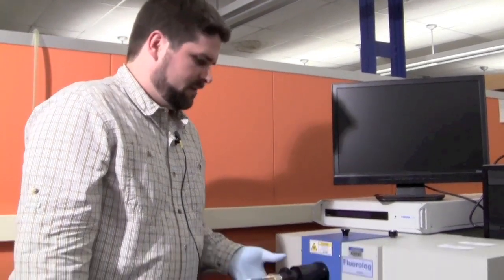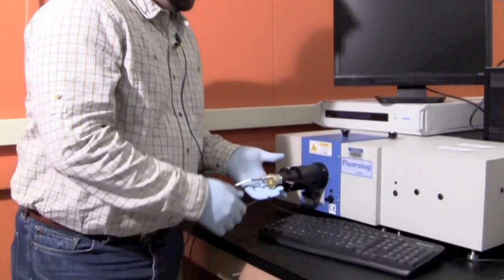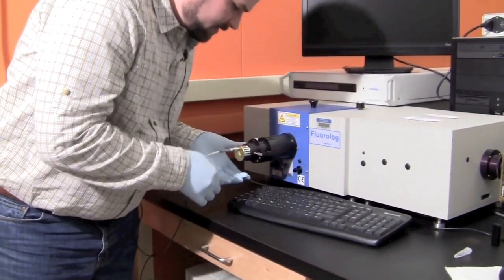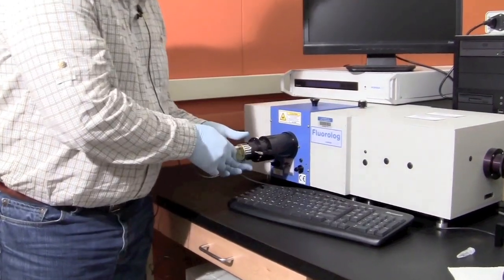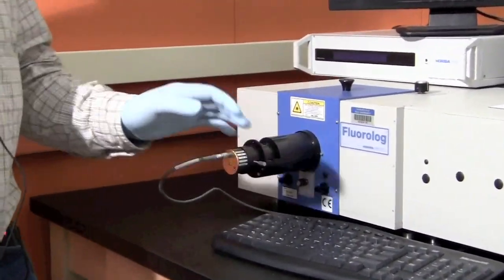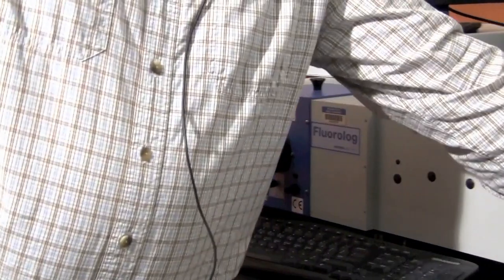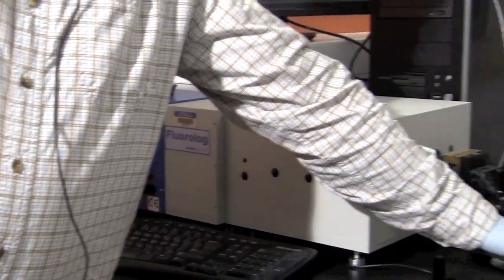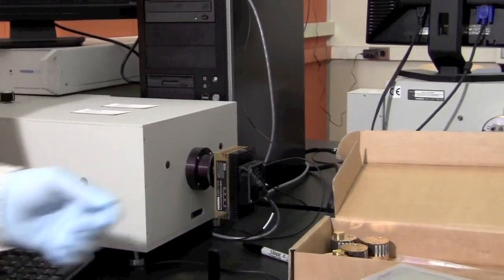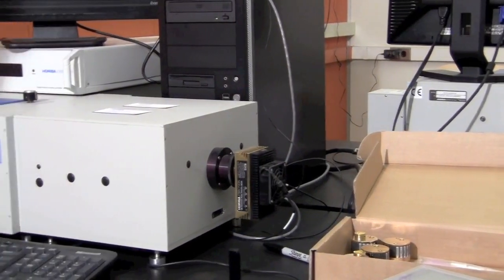First, you need to know the peak excitation and emission of the organic dye you'll be looking at. We'll be using Alexa 488 in duplex DNA, so I need to make sure my pulse source is the proper wavelength. This one is 390, so it won't work. You need to change out your pulse source. We have several to choose from. I need 459.